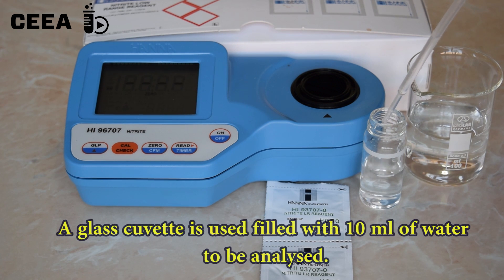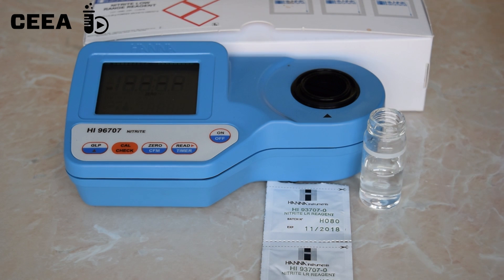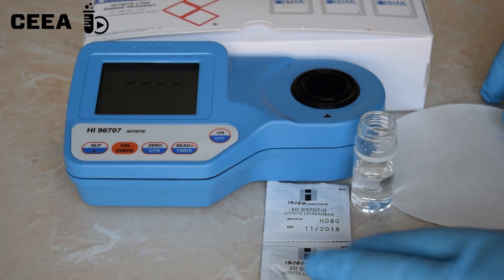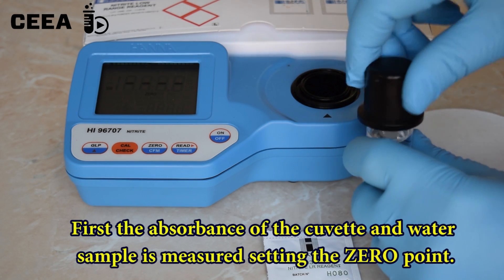For this, a 10 ml sample is placed in a cuvette. The photometer is calibrated by setting the zero point.